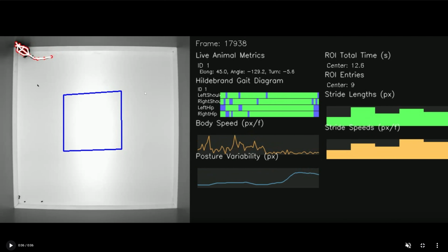Gait analysis is foundational for many research investigations, including neurodegenerative conditions. And by looking at the different variations and the phases, the lag and leading phase of the animal's hind legs, we can determine how much asymmetry is present in the movement of the animal. So basic gait analysis just allows us to track different body parts and to be able to calculate metrics that may reflect the variability in the posture from a control group.